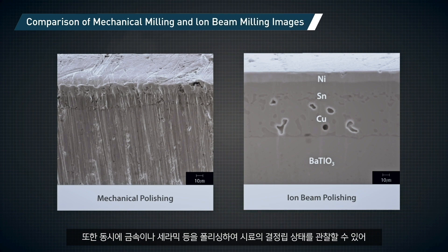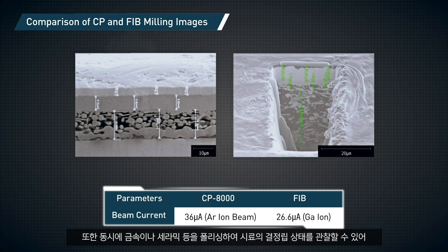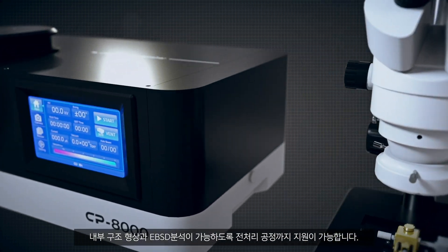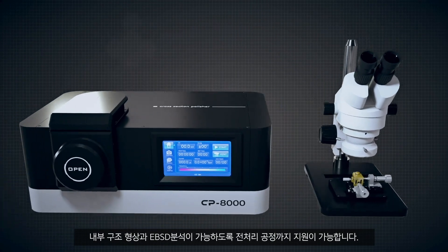In addition, the CP8000 can provide support for the preparation of metal and ceramic materials by polishing them for subsequent analysis of their internal structure images and EBSD data, so as to allow the observation of grains from these types of samples.